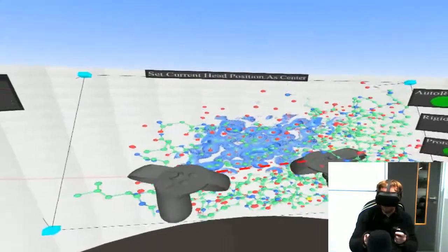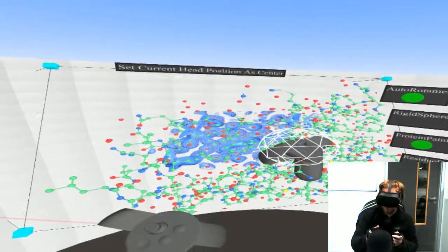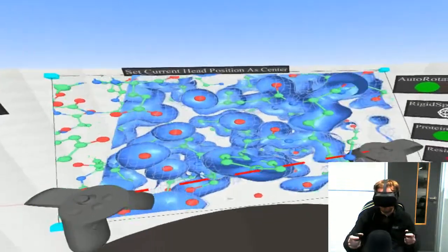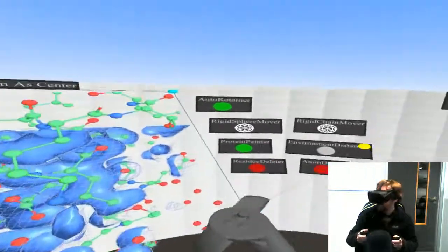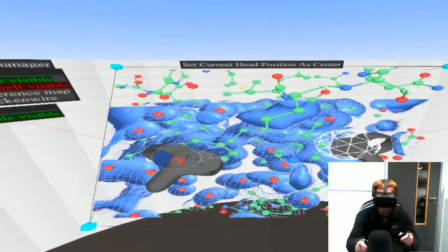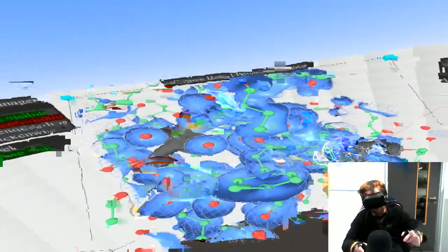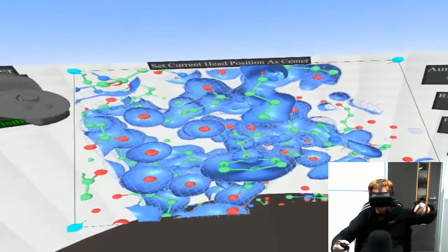If I resize it, my tool stays the same size, so I can actually grab a very large group of atoms. This is a version of the same thing, but if I grab with this, I should get this set of residues here, and I can have my hands be as far apart as they like on the chain.